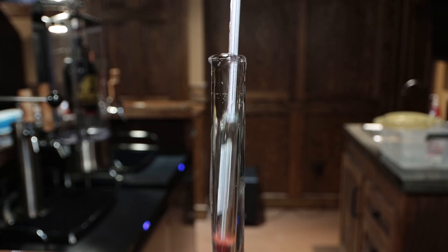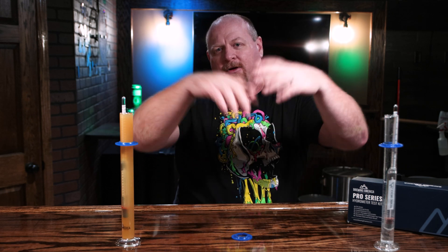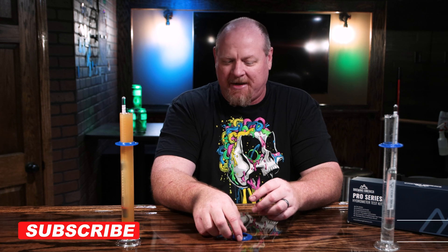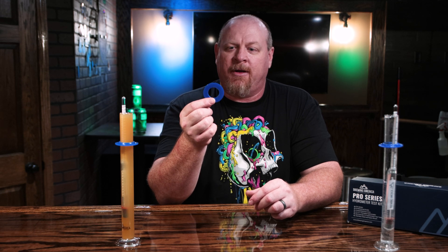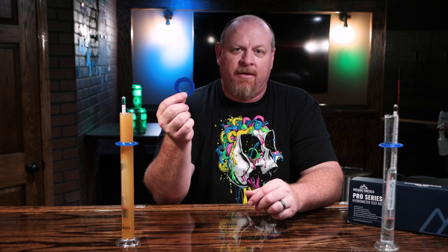How many people have filled their hydrometer flask, dropped their hydrometer in, and it overflows everywhere? I know I have done it many times. That is where this blue ring comes into play. This ring lets you determine what the liquid level should be in the hydrometer flask to take a reading without overflowing.